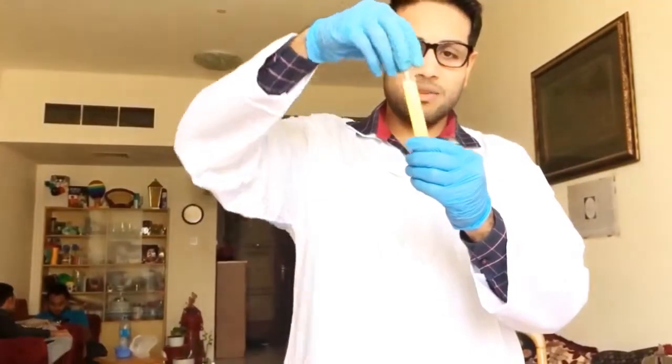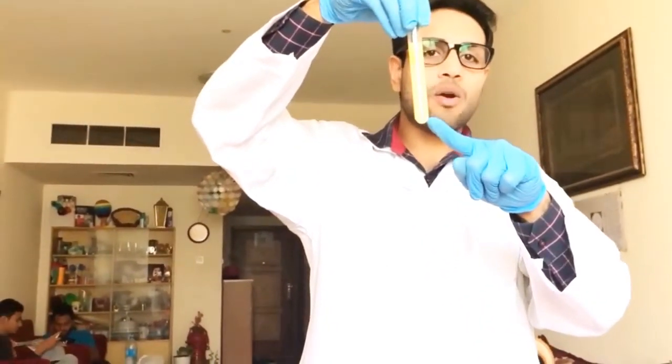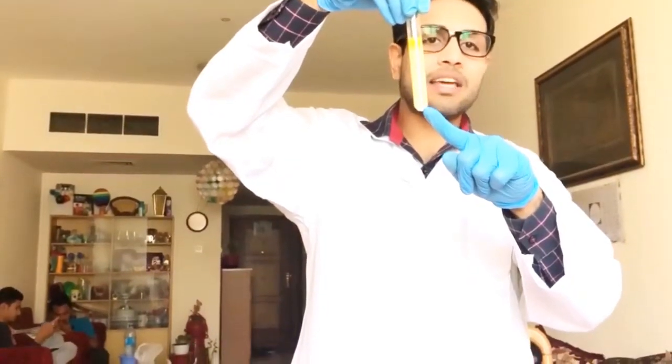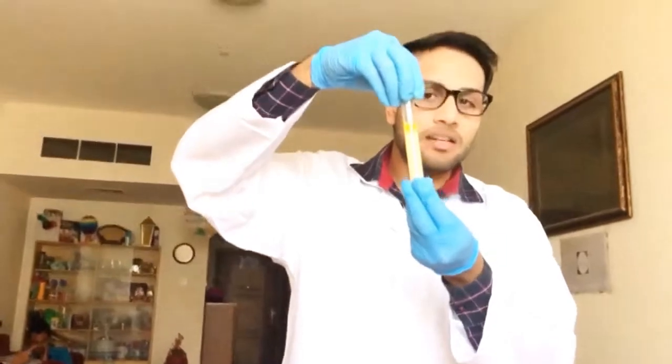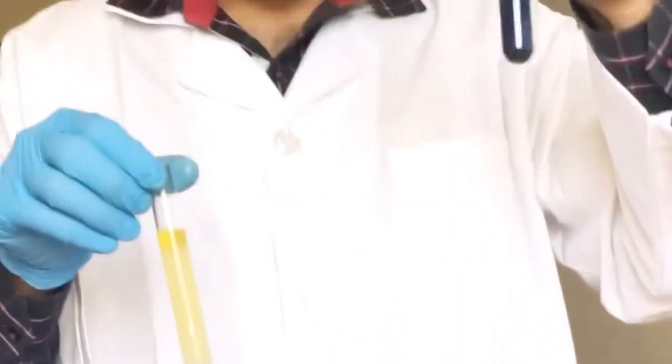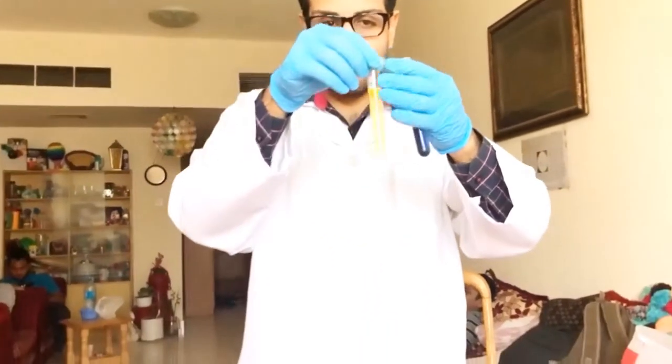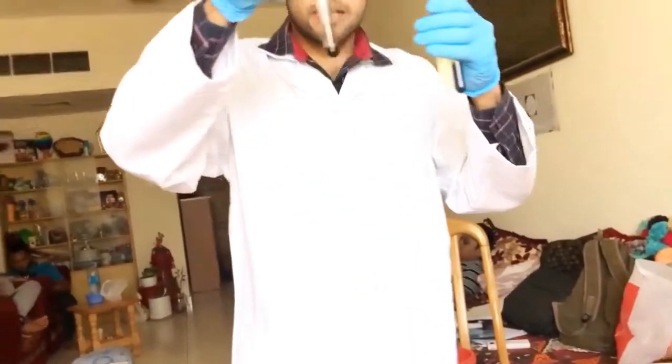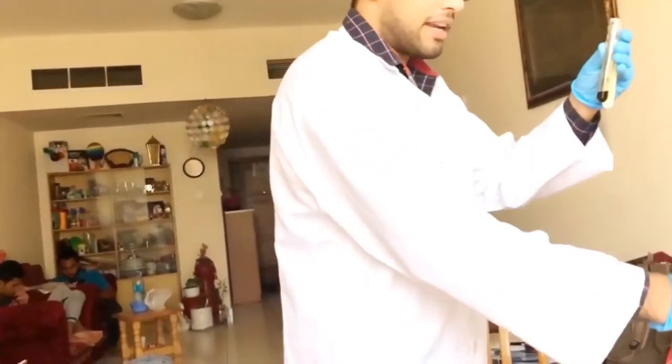If anything contains fats it will change into white or cloudy. As you can see here, it has changed milky or cloudy. This is the proof that fats are present in our oil. These are the four tests that we have performed: the lilac purple which changes with time, the fats test, starch iodine test, and finally our sugar test which turned into brick red.